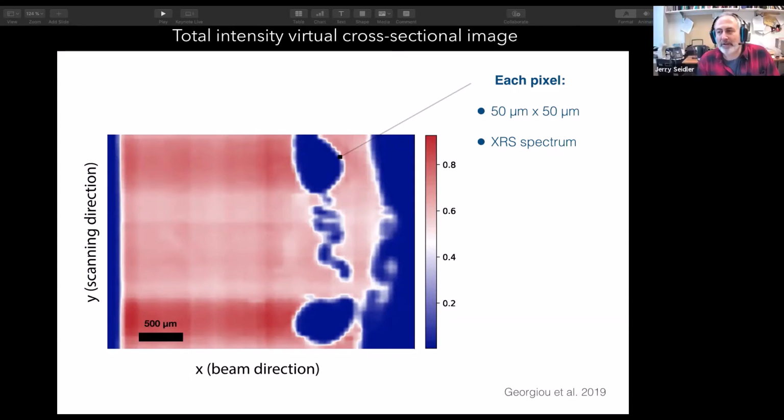How long did the total measurement take? It took a lot. This is Raman scattering, and you need a spectrum at every pixel. A day, 2 days, or roughly how long? It was a day.